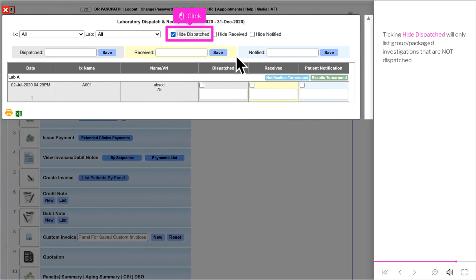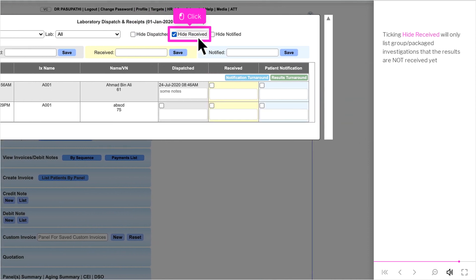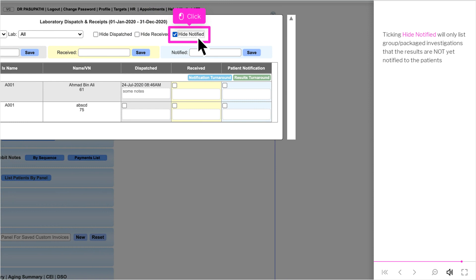Clicking Hide Dispatched will only list group or packaged investigations that are not yet dispatched. Clicking Hide Received will only list those whose results are not yet received. Clicking Hide Notified will only list those whose results have not yet been notified to the patients.